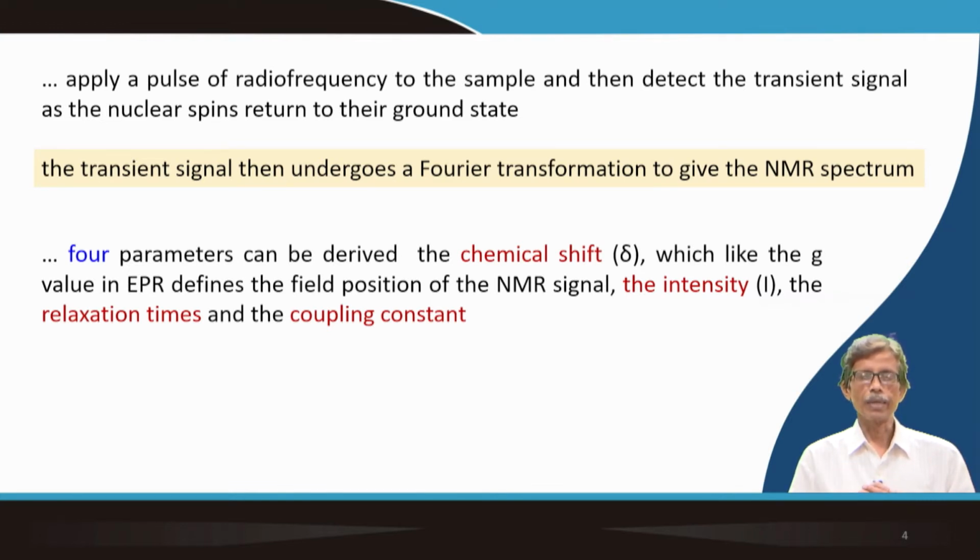Then we measure the chemical shifts, the delta values in ppm we record, even for some very small organic molecules, say phenol, the tyrosine radical. When we are not getting anything, we should be able to detect the corresponding presence of the tyrosine radical or the tyrosinate ion, which is bound to, say, a copper center. Just now we have seen.